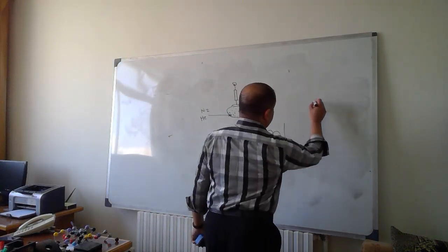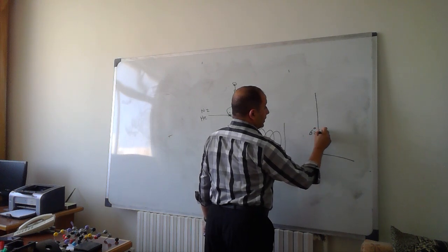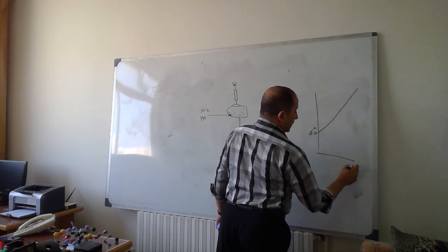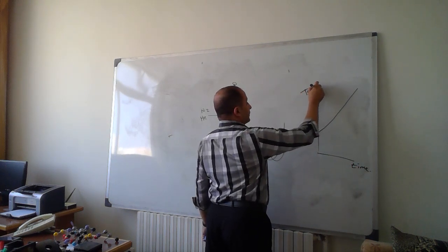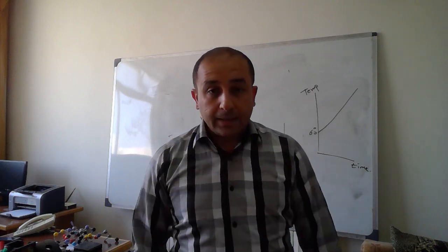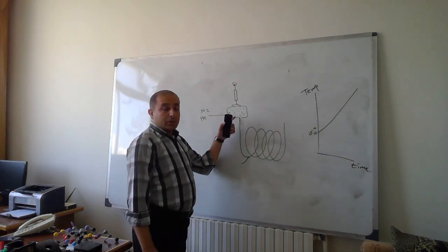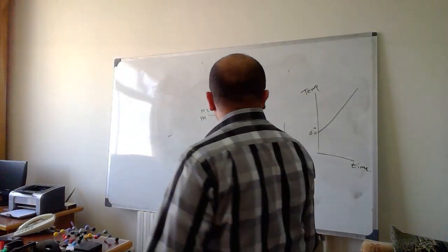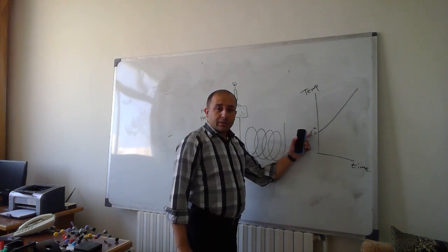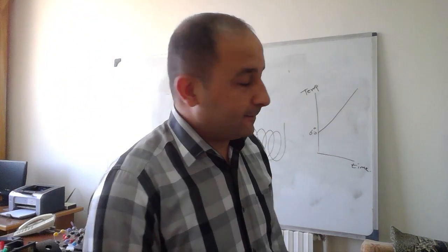So it usually starts, for example, from let's say 60 degrees, then the temperature will be raised versus time. The idea is that the sample, once we inject it, will go as a gas to the inlet of the column. Immediately, due to the relatively low temperature, which is 60 or below, the sample will be condensed.